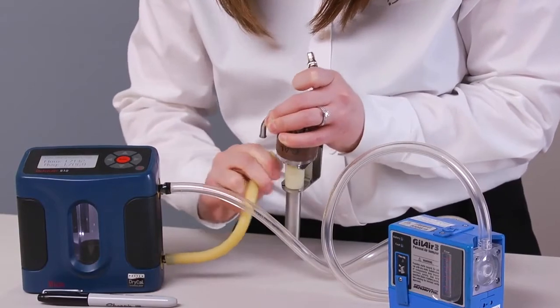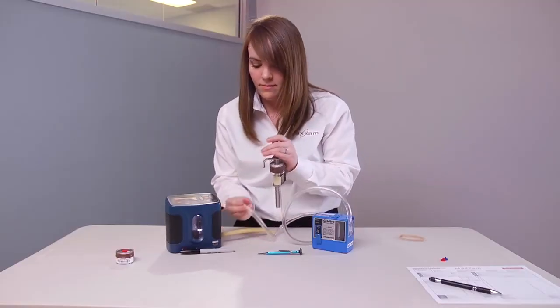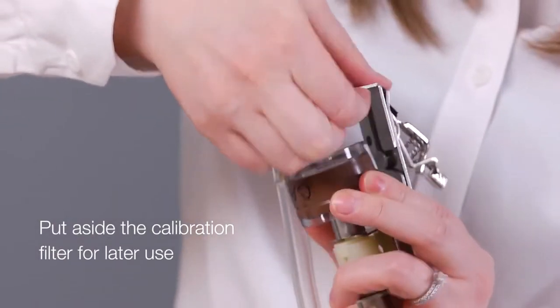Now remove the shorter piece of tubing. Disconnect the end of the long piece of sample tubing from the calibrator outlet and connect it back to the cyclone. Put aside the calibration filter for later use.